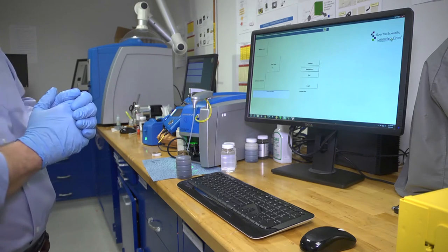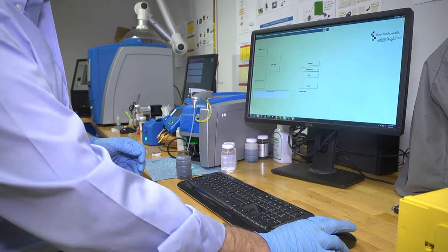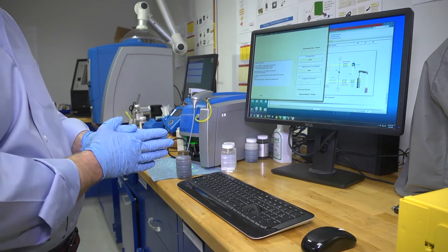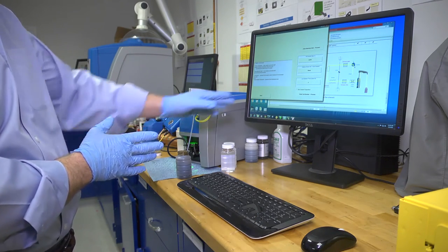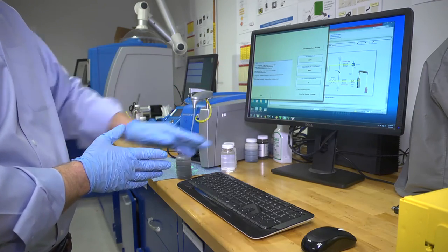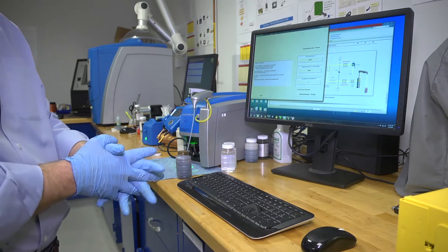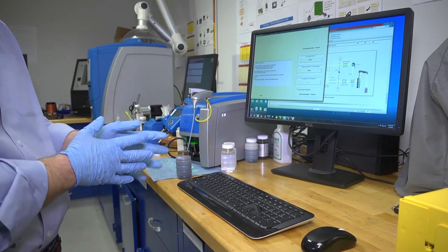We'll run this one as a simple sample. So you go and click on start test. There's some options on this screen. The only one that's really required is the entry lab number. You can select a dilution ratio.